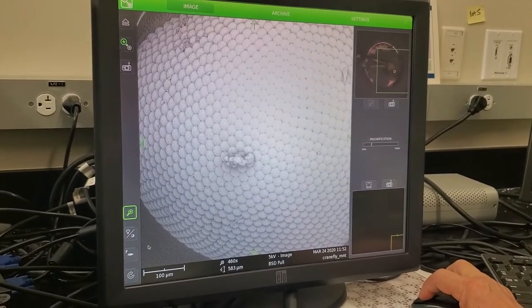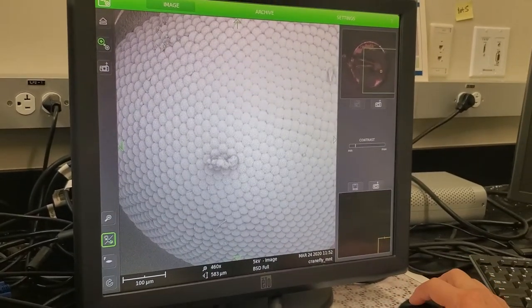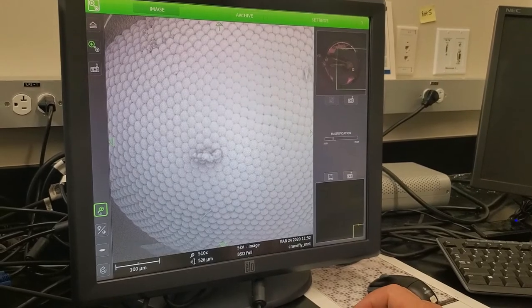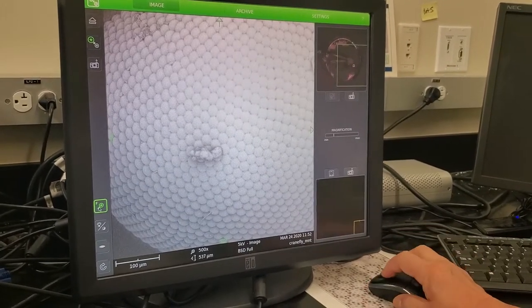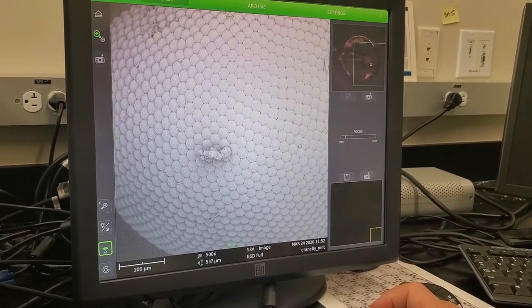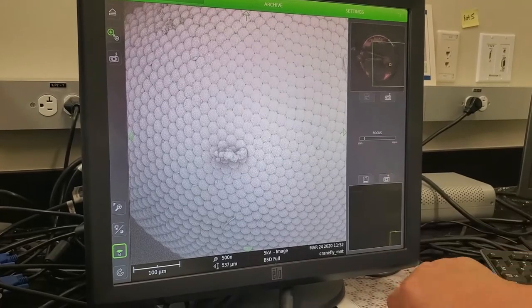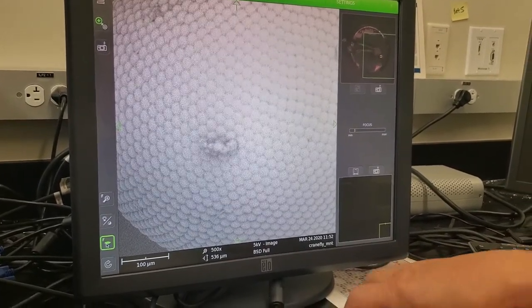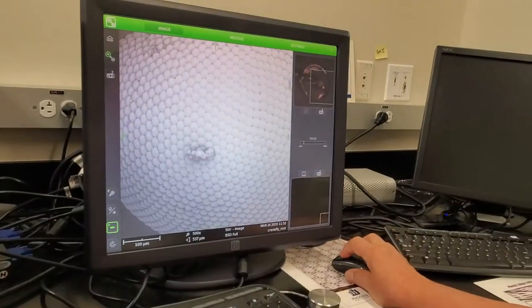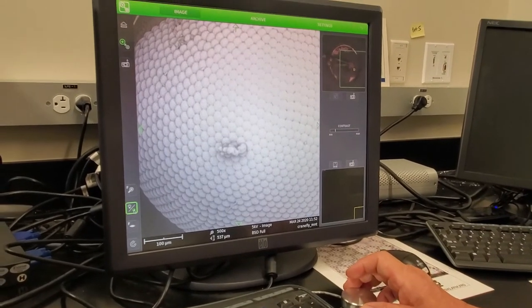Look at that — it's about a circular thing. What we're going to do is change the contrast a little bit. It says about 400 something — let's go to 500. Click on it. Now I'm going to focus in. You wag it back and forth — oh, that looks pretty good. About right there. Now click on it. Fine. Now what you do is turn it either way, wag it and make it the sharpest, concentrating on one of the lines.